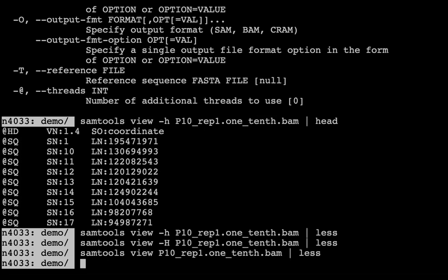So my point of this workshop is how to align the reads. So tomorrow we will be doing only alignment. This path is this, how this is, what here the cluster. So the address of the cluster.